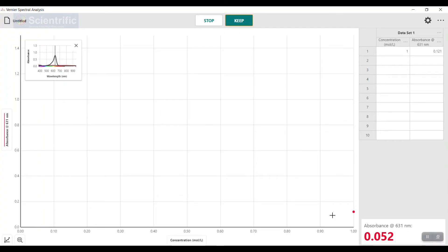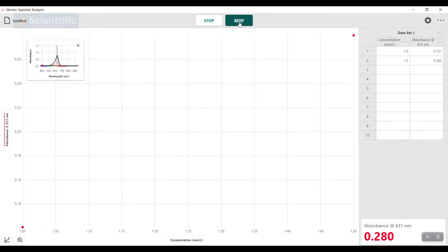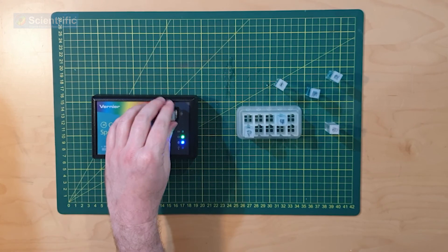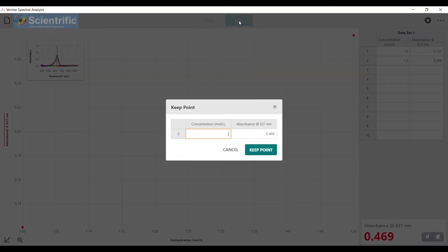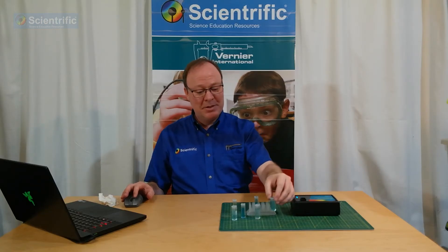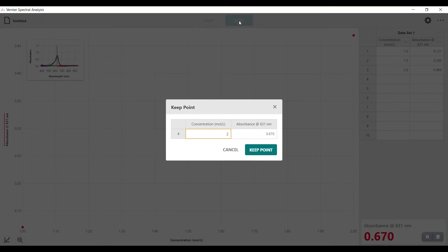I'm going to wait for the absorbance to stop moving, and go Keep. As I said, it was 1.5 — I'm going to keep that point. A nice interesting thing with Spectral Analysis is you can also see the absorbance peak over here grow as we do higher and higher concentrations. I'm going to place in my third one. This one was 2 — waiting for it to stabilize. It has, so I'm going to go Keep. And the final one is my 2.5. Keep — so, 2.5.